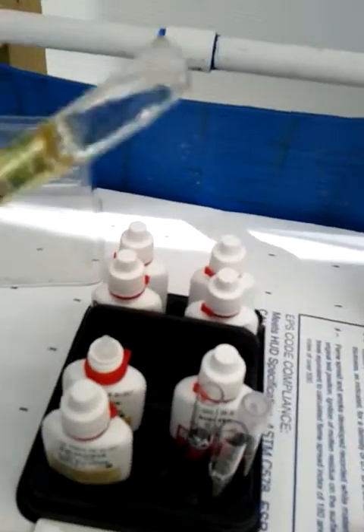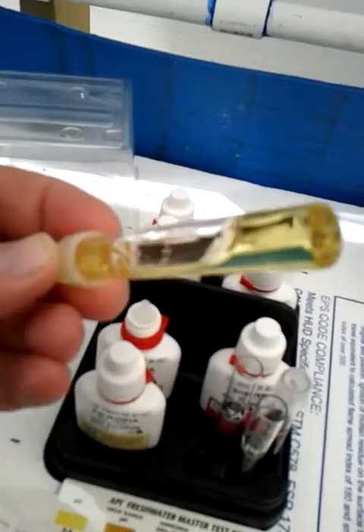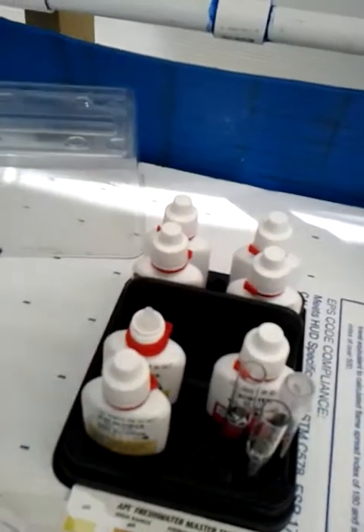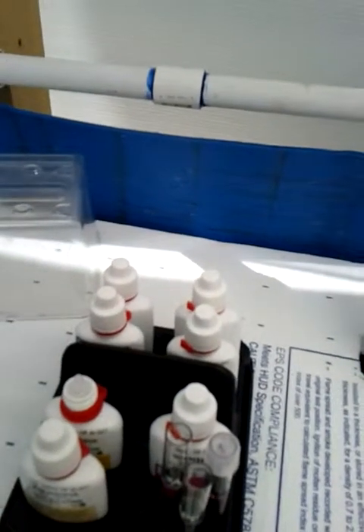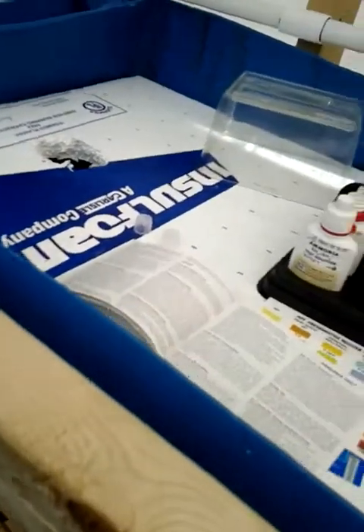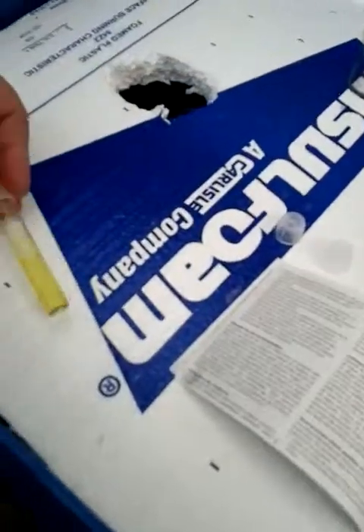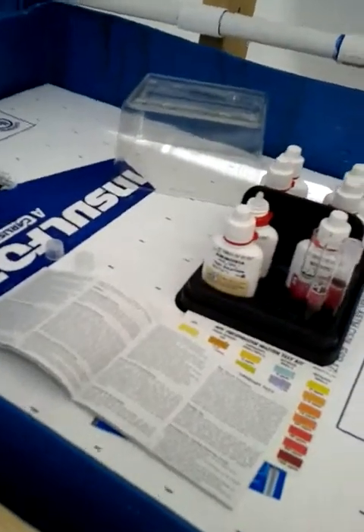Now for this test it says that you've got to wait 5 minutes for the results, so we'll just try to be patient here. This one seems a little dangerous — it says it was corrosive. I'll put a little bit on this foam and see if it ends up eating it, but who knows.